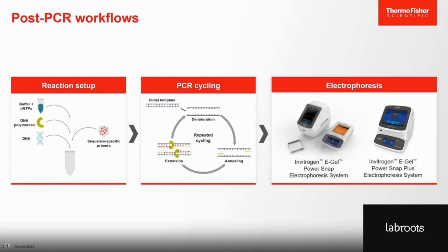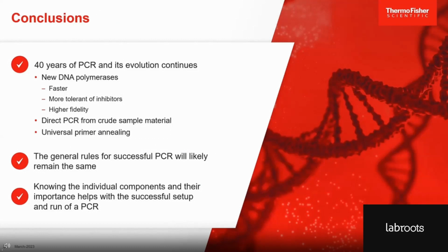If the product is needed for cloning, the PCR product is cleaned up and later sequenced as well to check for errors. So there are many roads that lead from here, as PCR is a part of quite a variety of workflows in molecular biology. The method has evolved enormously since its invention about 40 years ago, thanks to faster and more robust DNA polymerases like the Platinum II Taq and Platinum SuperFi II.